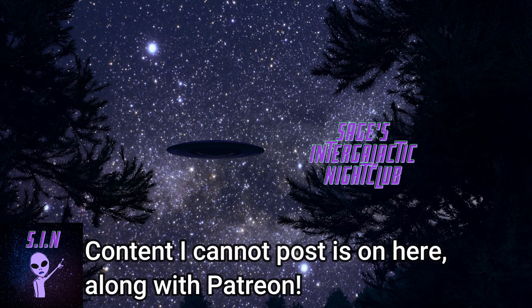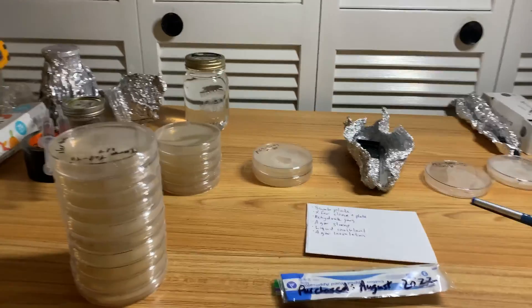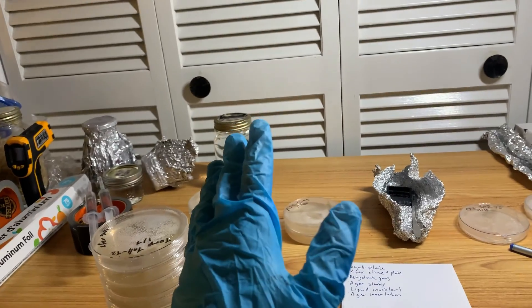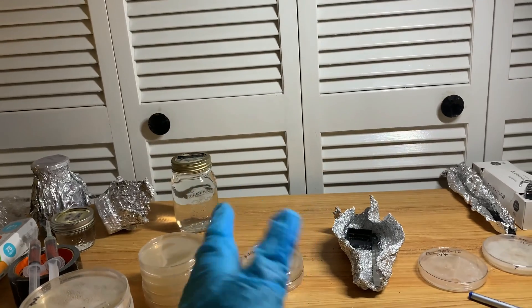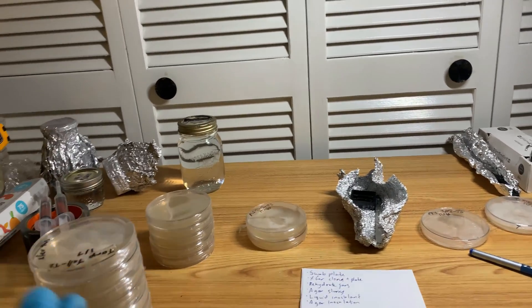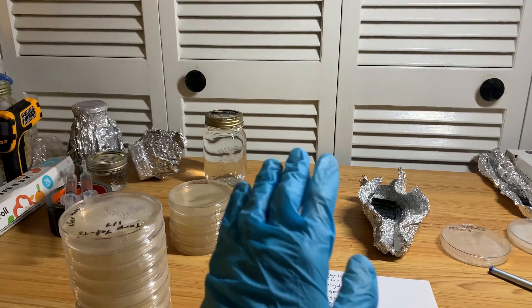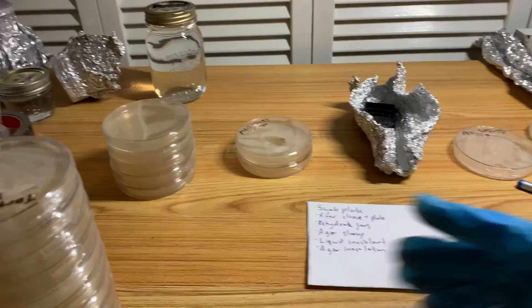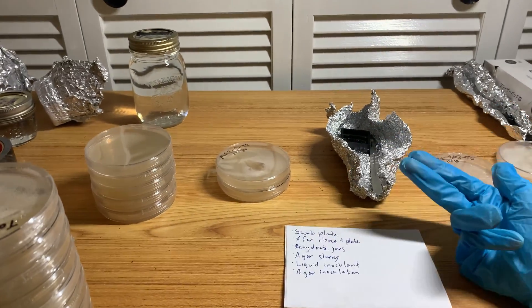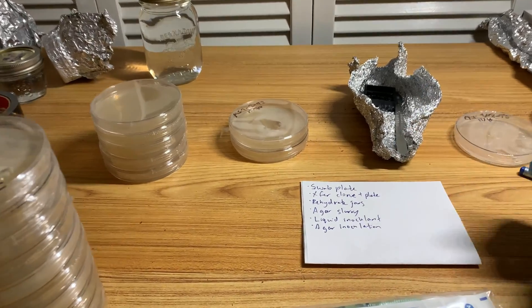Organize your tasks in the SAB — it's very important to organize what you're going to do, because with a SAB you don't want to be thinking, 'Oh, I forgot to bring this in, oh I got to do this.' You don't want to bring things inside the SAB once it's set up, because you're going to be bringing in outside contaminants. Over the years, I've found that if you're going to do numerous things in a SAB, you want to make a list and plan everything out so you can go smoothly.